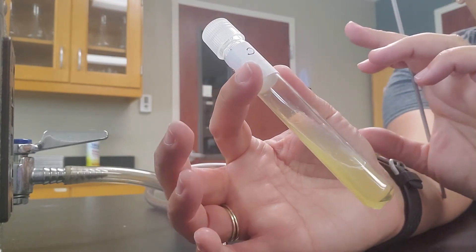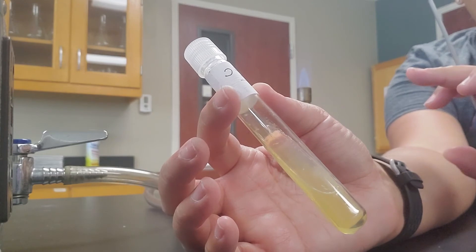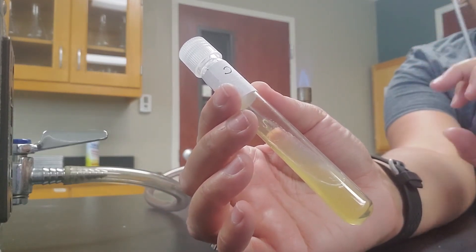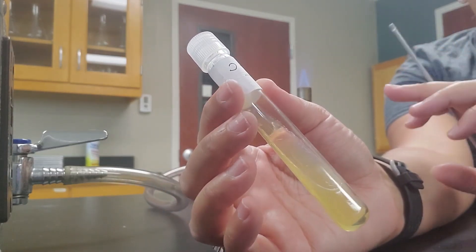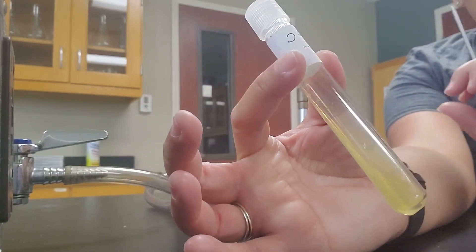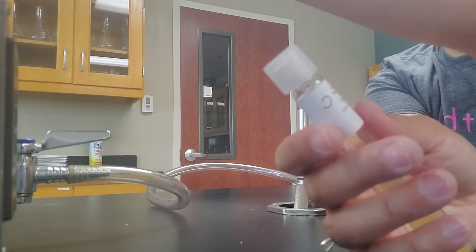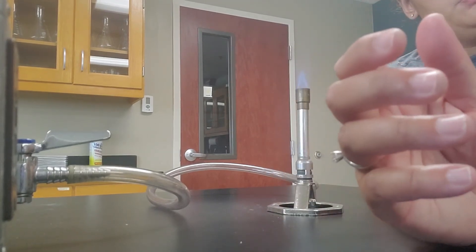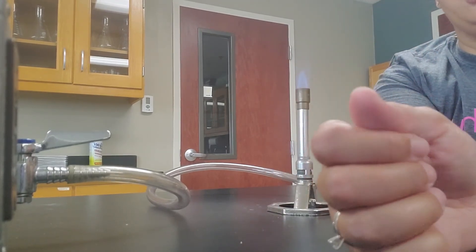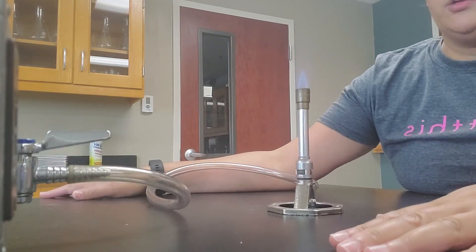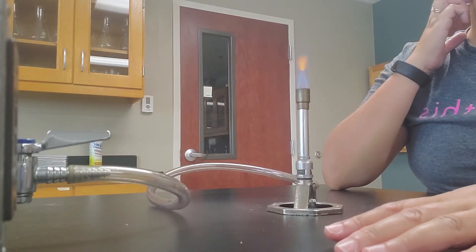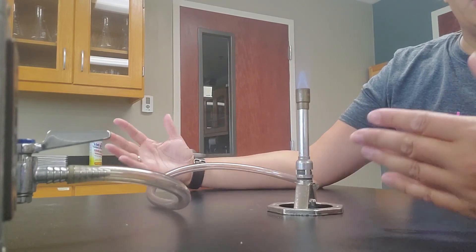And same thing, aseptic technique, you're going to flame your loop initially. You're then going to flame the tops of the tubes, take a sample, transfer it. Once again, reflame the loops, cap them, and then reflame your loop. And then you are done. So the whole purpose is that aseptic transfer. The aseptic transfer is just making sure that you're not going to go ahead and transfer any unwanted bacteria.